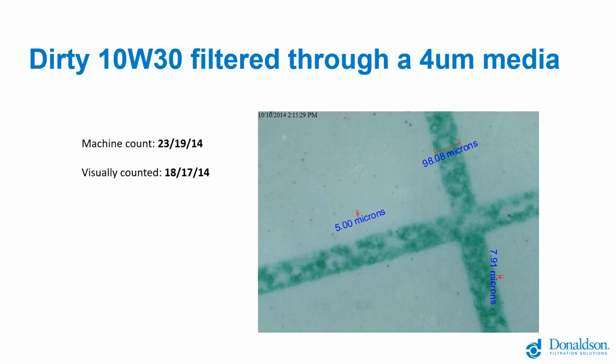The machine continues to read high because it is counting those little gray spheres we saw in the pictures, and it's confusing the machine. It's trying to count the hard particles, but it's counting all that other material that's suspended in the oil along with it.